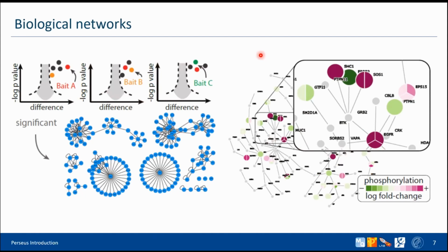And then you can also, and this is a development that was done by Hamid, if I'm not mistaken, a colleague of ours in our group, search this large network in the context of your experiment. So you pull the network and then you analyze it in the context of your experiment. But we'll see about it in another presentation, I think, with Carlo.